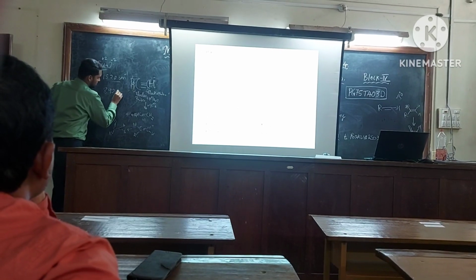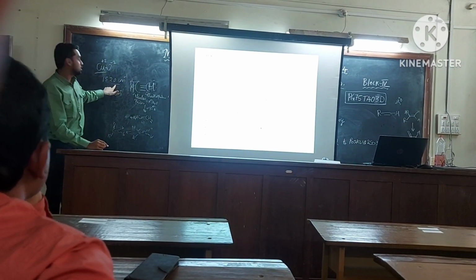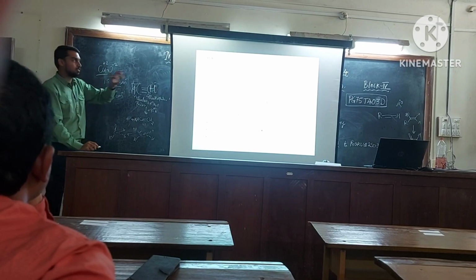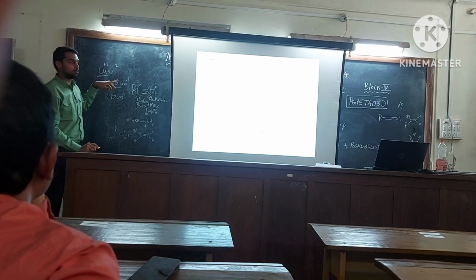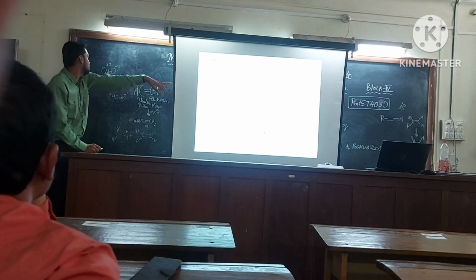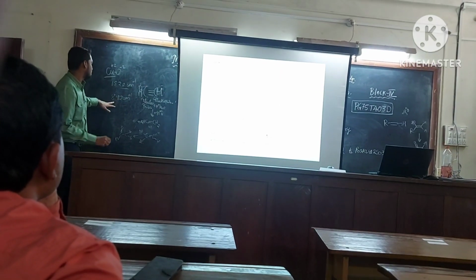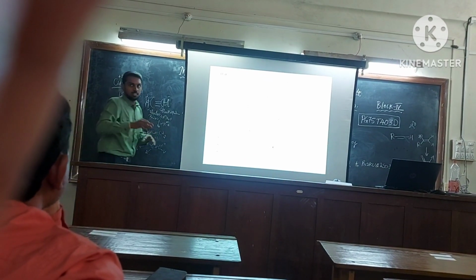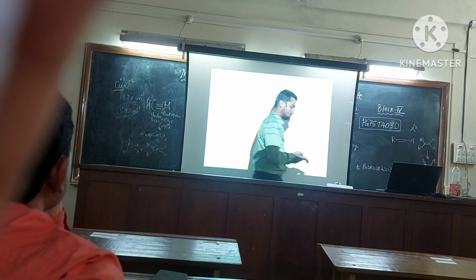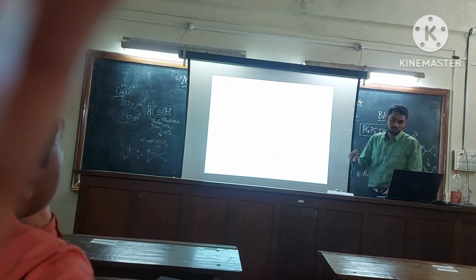But here we got 890 per centimeter. So it clearly shows that this peak is missing. Initially, if you would have taken the FTIR for copper sulfate, definitely you would have got this peak. But because there is no such peak at 15-20 there, it has disappeared, and also a new peak has arrived at 890. It means copper +1 has appeared. So that is also evidence which tells us that copper +1 has formed.